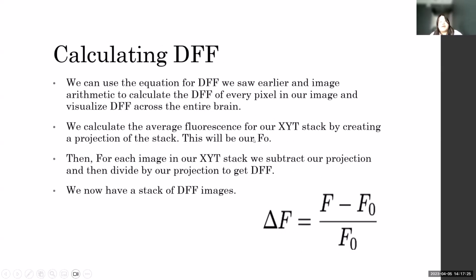So how are we going to calculate the DFF? We're going to use the equation that we saw in previous slides and image arithmetic to calculate the DFF of every pixel in our image and essentially visualize it across the entire brain.